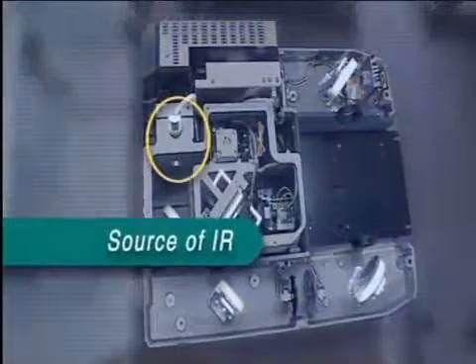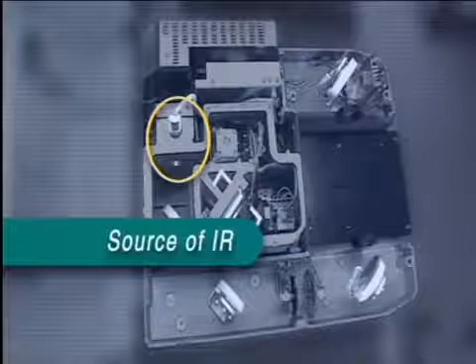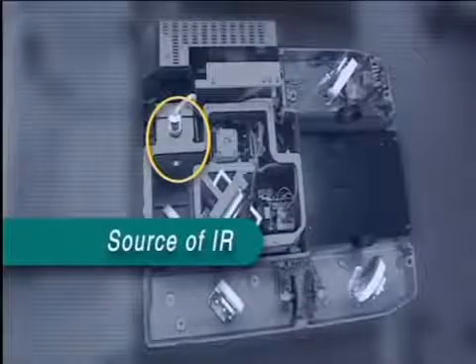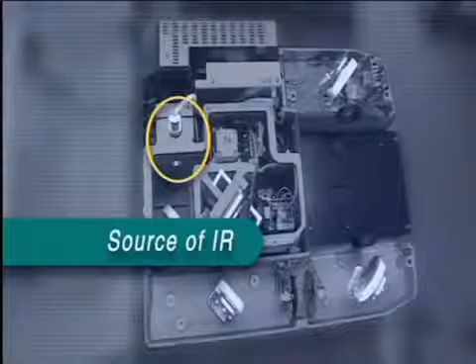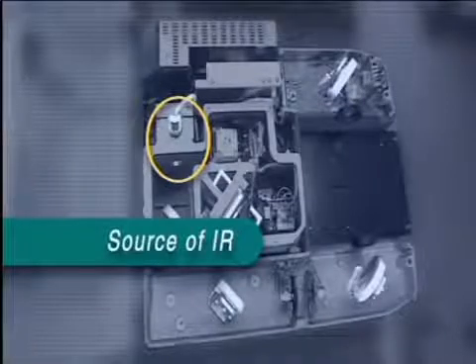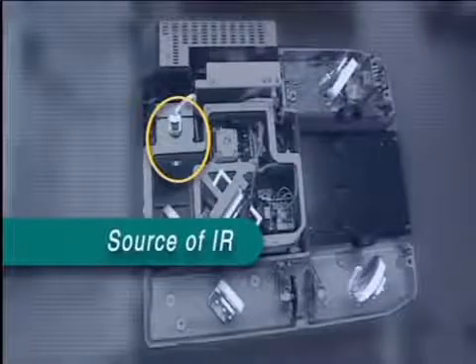All IR instruments have a source of IR radiation. This is a coil of wire surrounded by a ceramic capsule, which is heated electrically so that it gives out IR radiation, in other words heat, over a whole range of frequencies.